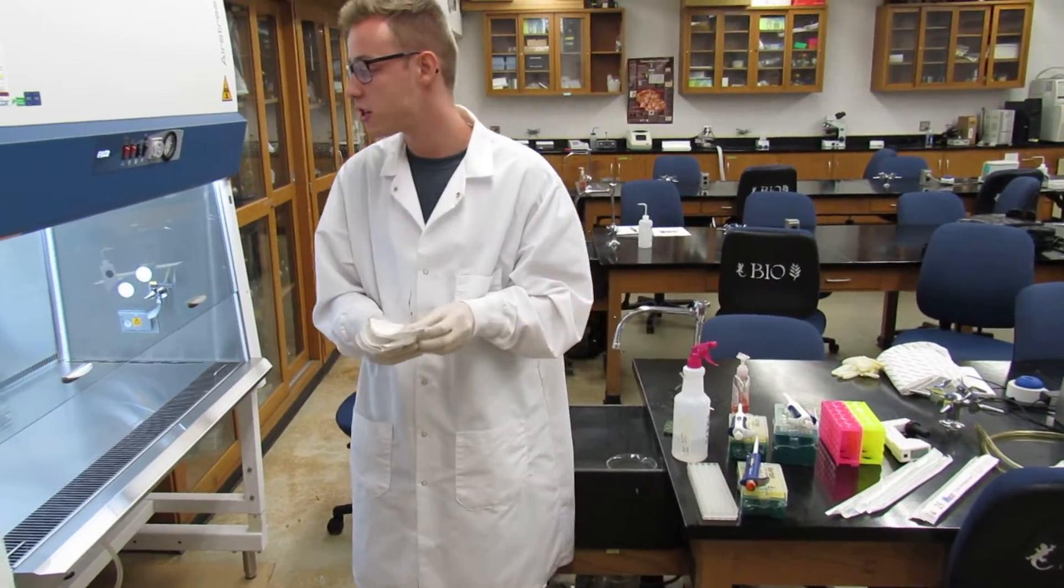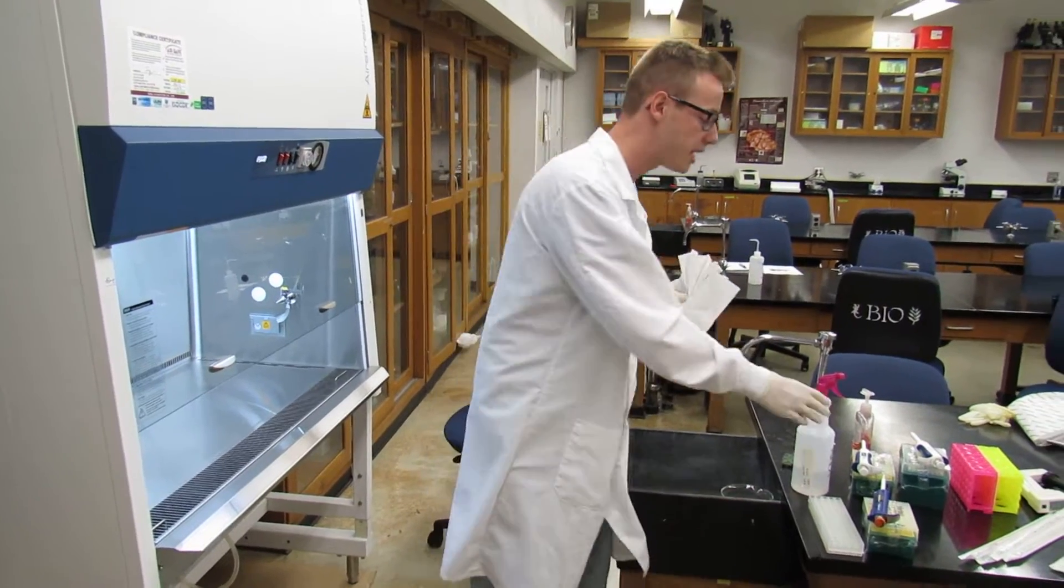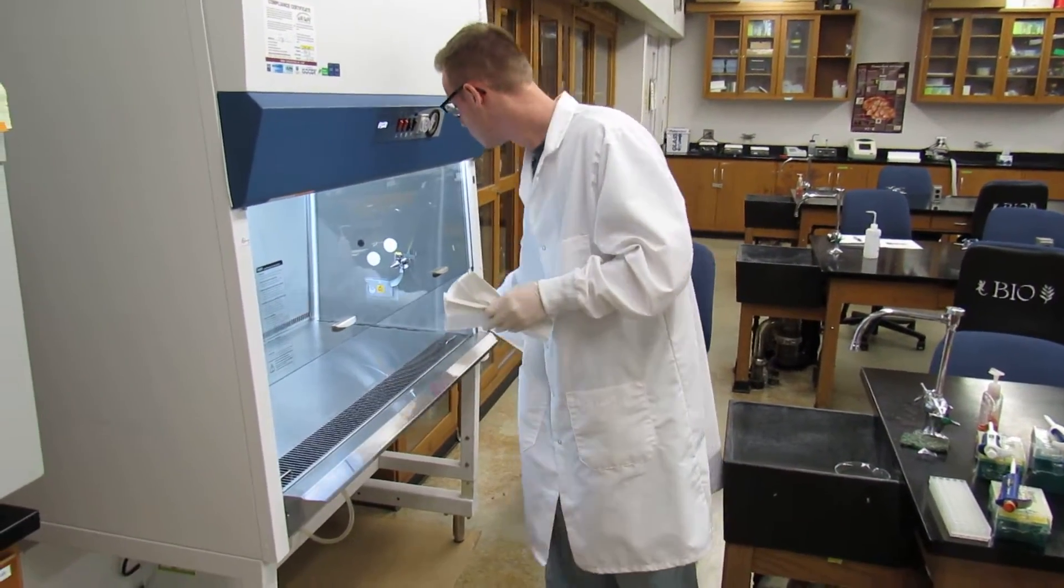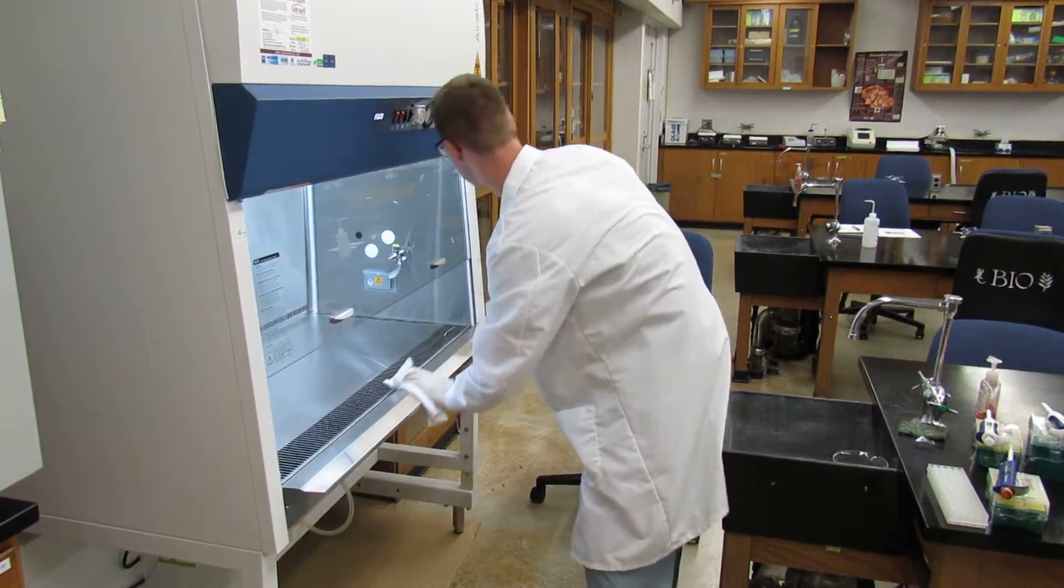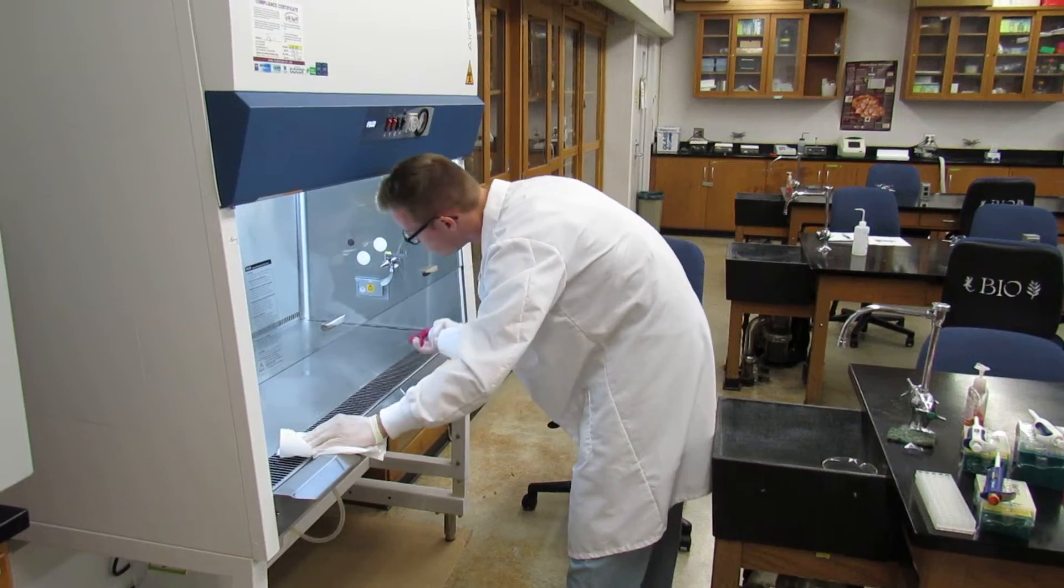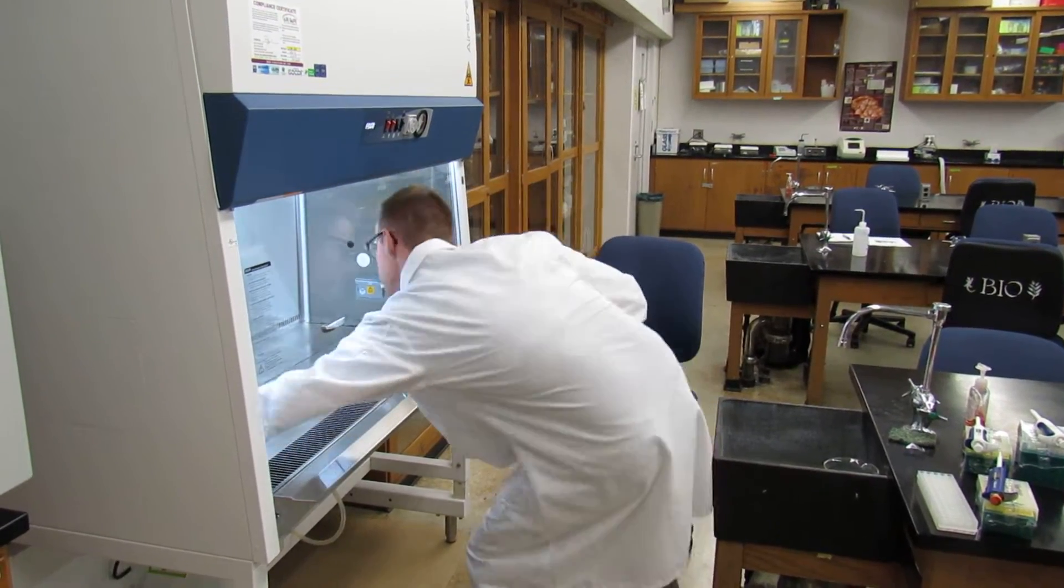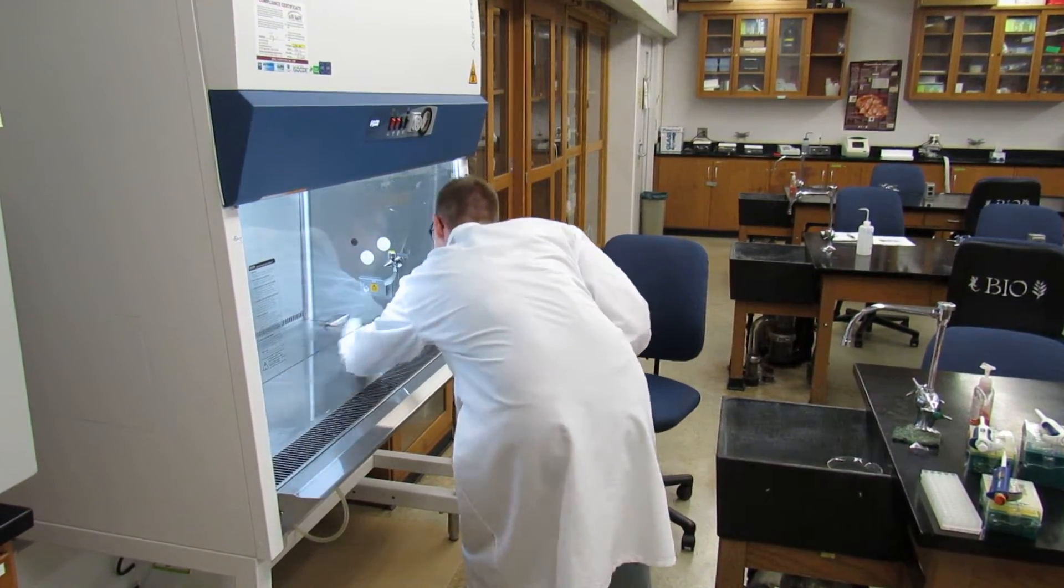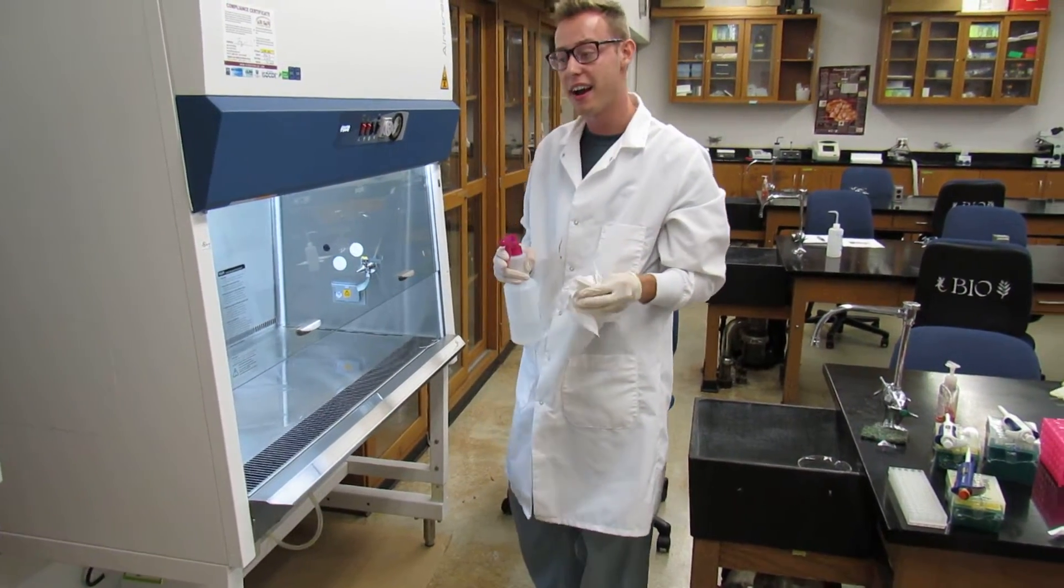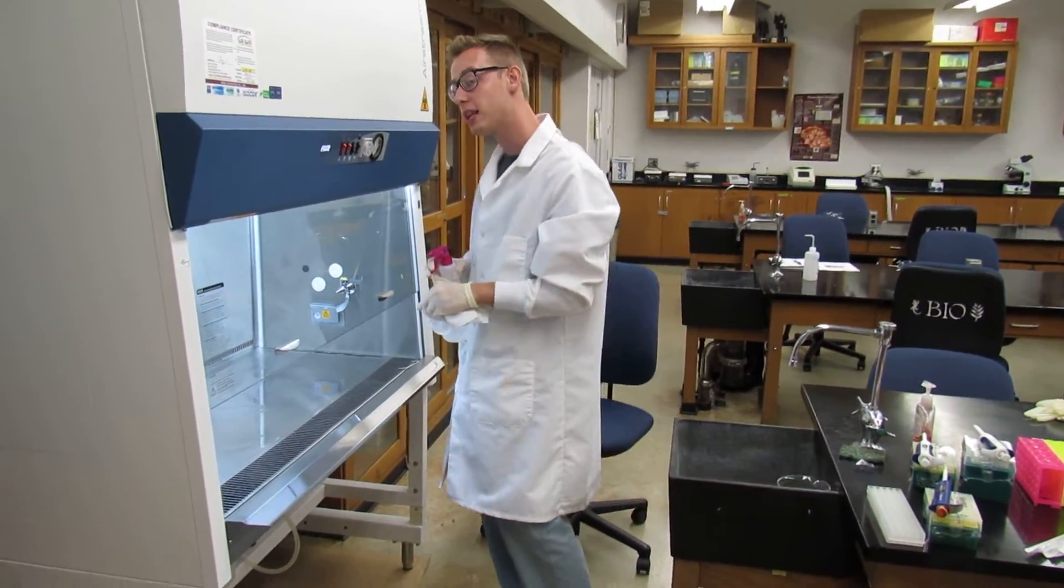After the blowers have turned on, you're going to want to spray the inside of the cabinet with 70% ethanol to make sure the area is sanitized properly. Make sure to spray the entire area of the cabinet, including the sides of the wall.